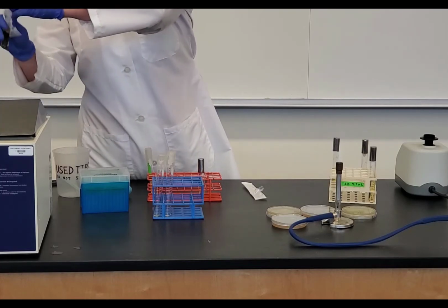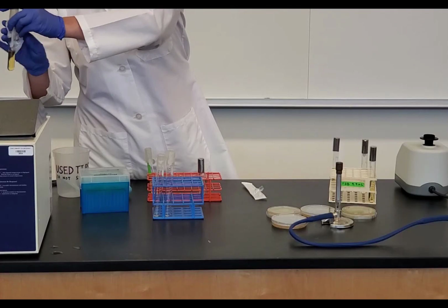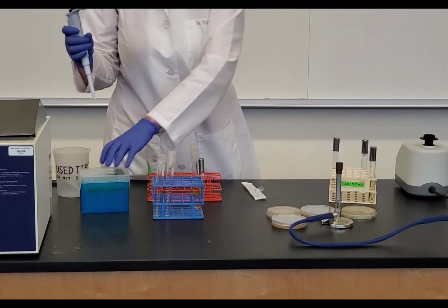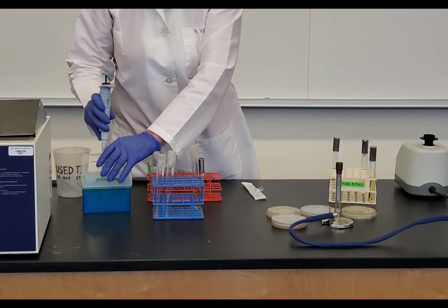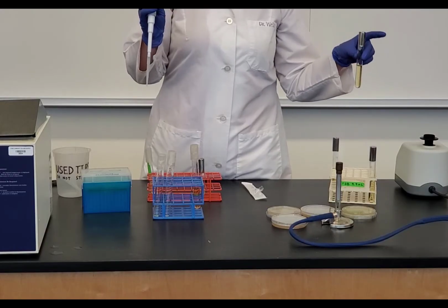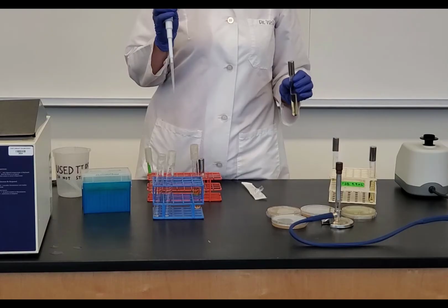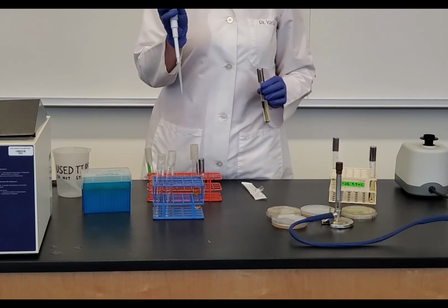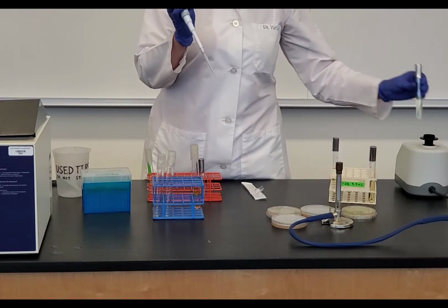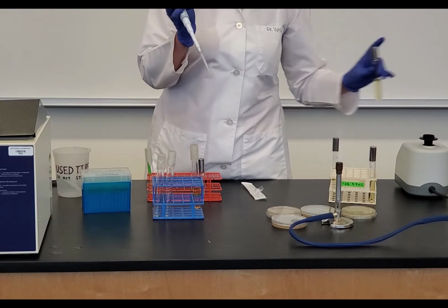And again, I'm going to dry it off so that I don't transfer water all over from the water bath. I'm going to put it here. I'm going to put a tip on my pipette. And I'm going to go back to my 10 to the negative 4. Because my 10 to the negative 4, I need a plate on my 10 to the negative 4. If I transfer 1,000 microliters, that's equal to 1 milliliter, which means my dilution stays the same. So I'm going to vortex to mix this before I go in there.